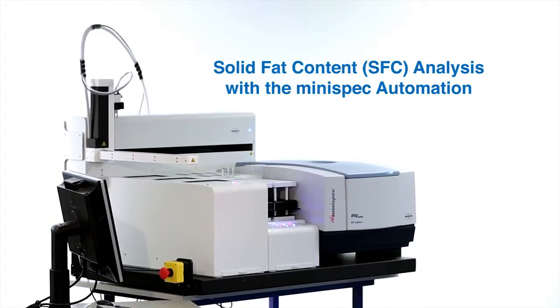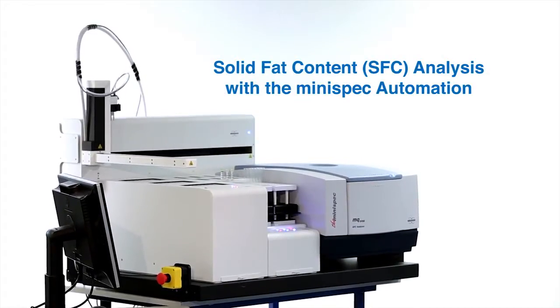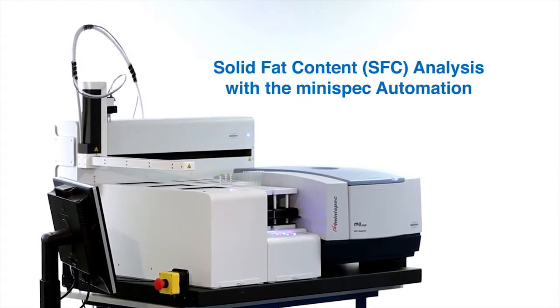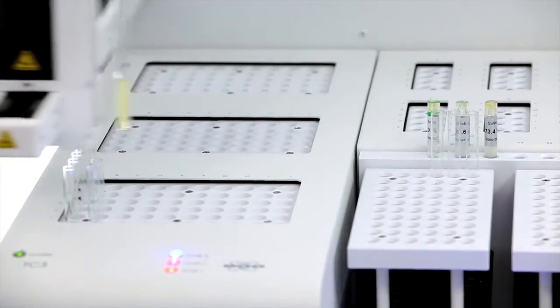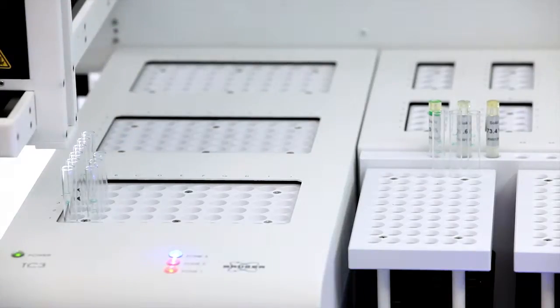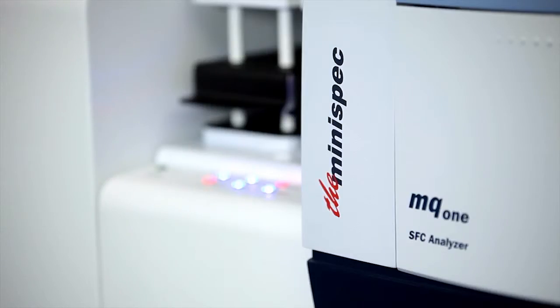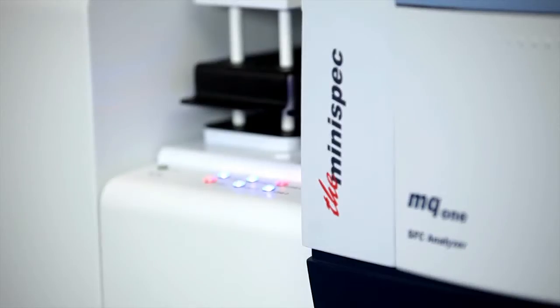Bruker now offers a one-stop shop solution for the automated determination of solid fat content in fat compositions. With the Bruker solution, all steps from sample introduction, all tempering steps as well as the NMR measurement are carried out with ease and confidence.